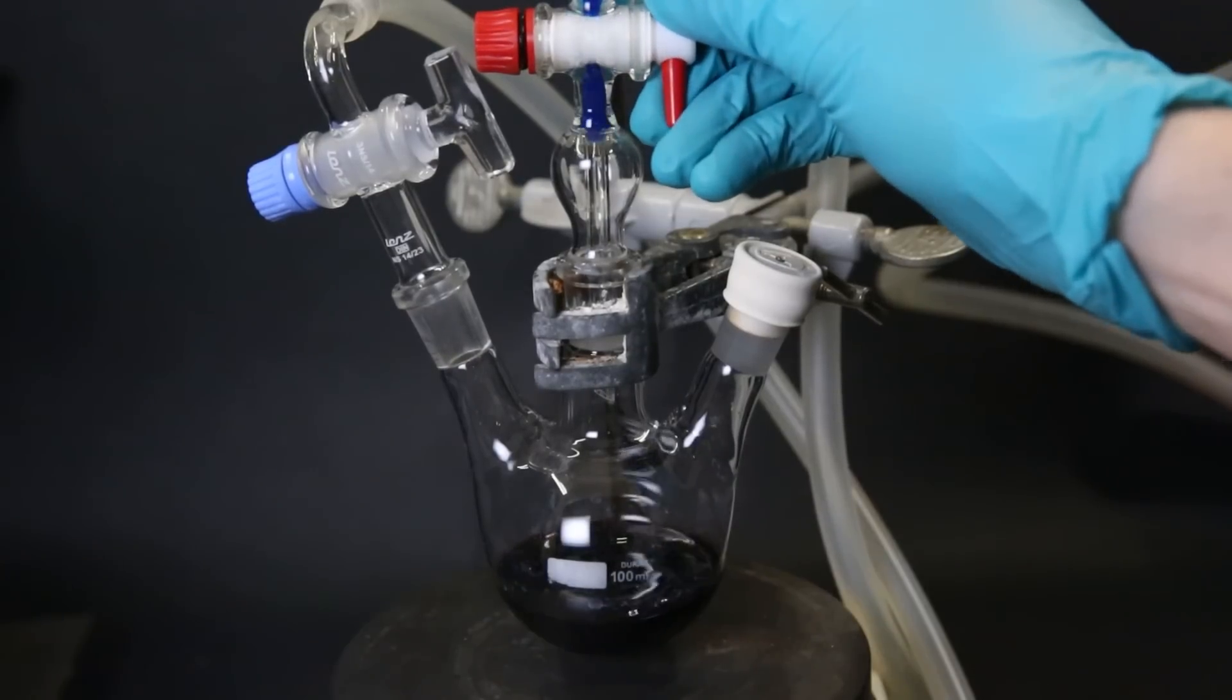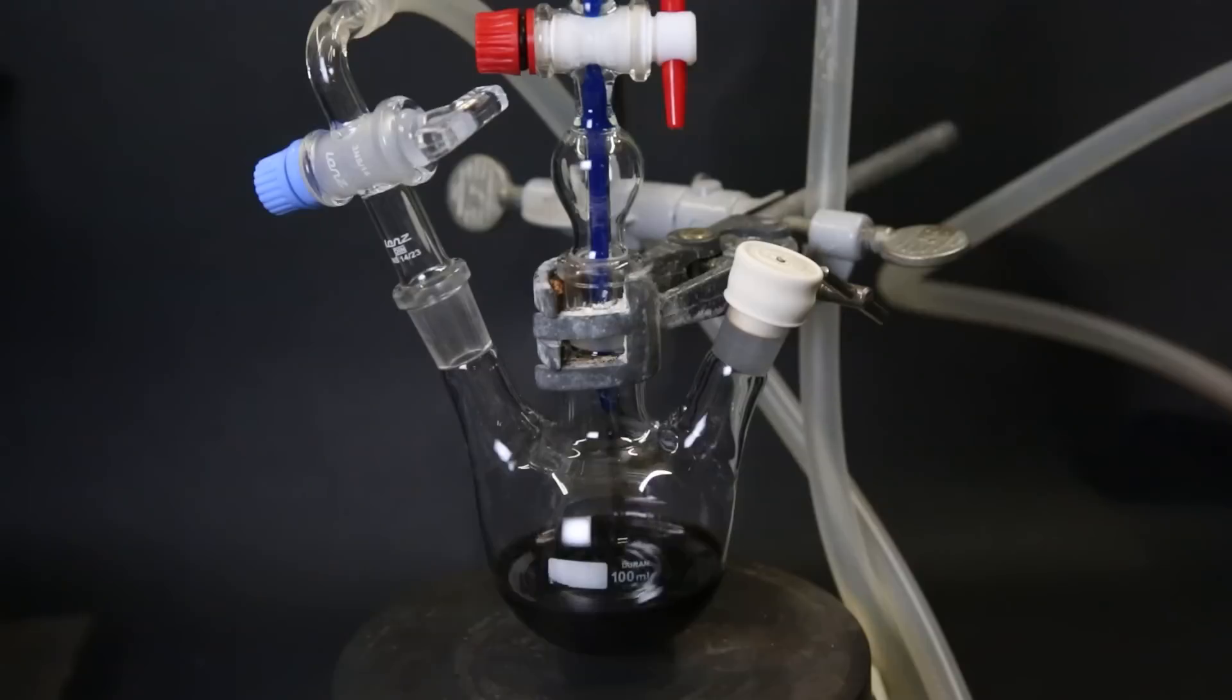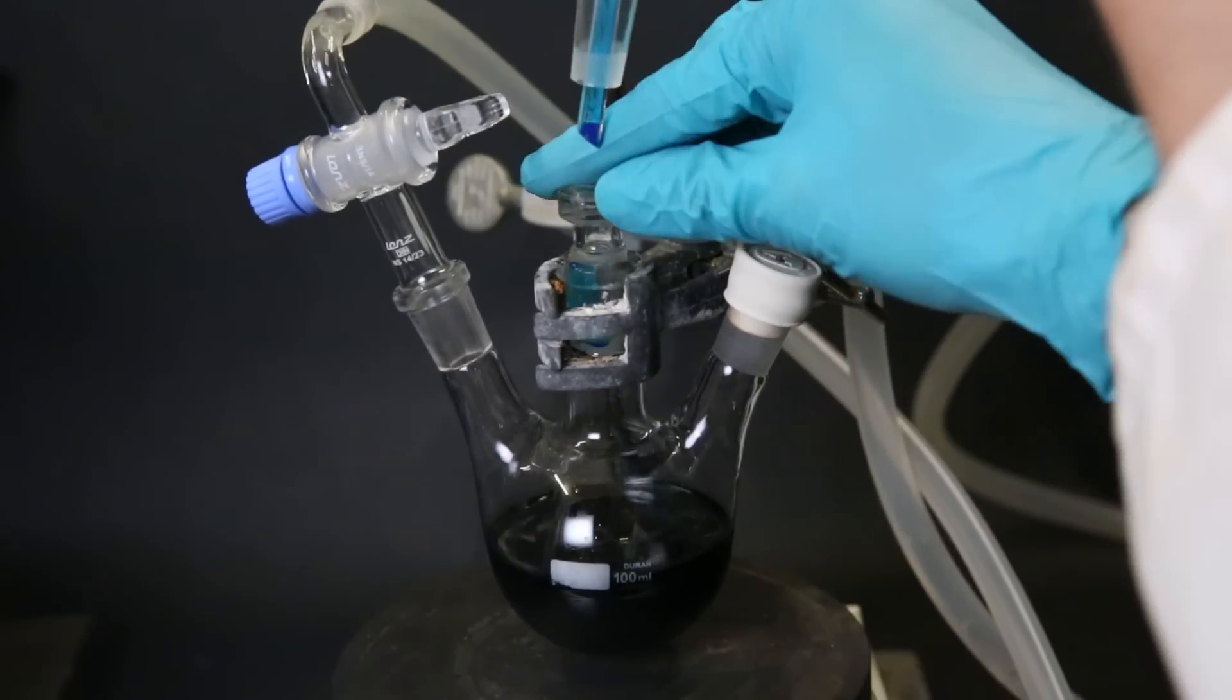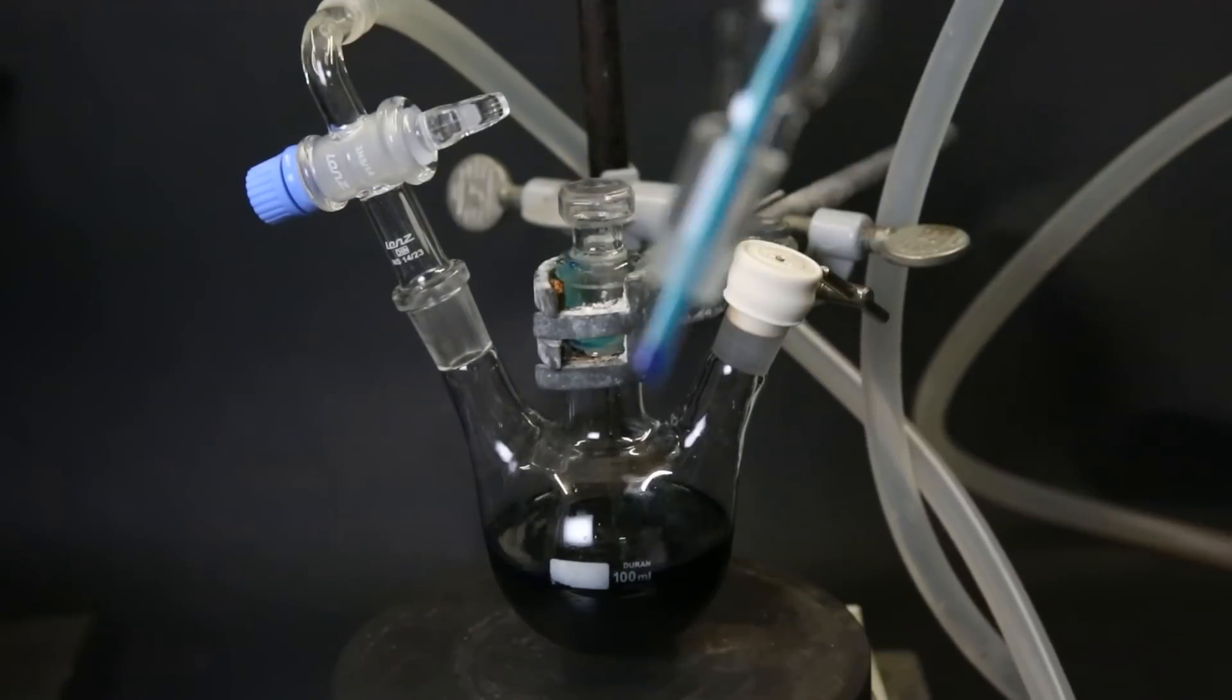Then under constant argon flow, I slowly add the cobalt(II) chloride solution to the sodium cyclopentadienide solution. During this reaction, we are producing the cobaltocene, which should be a dark purple. But because the solution is already dark, it is impossible to see if anything is produced. When everything is added, I quickly remove the dropping funnel and put a stopper in its place. I then leave it to stir overnight.